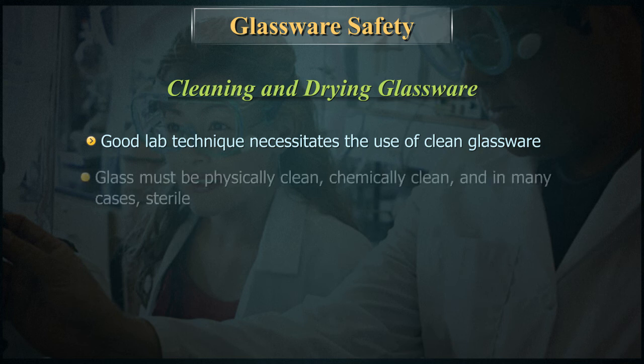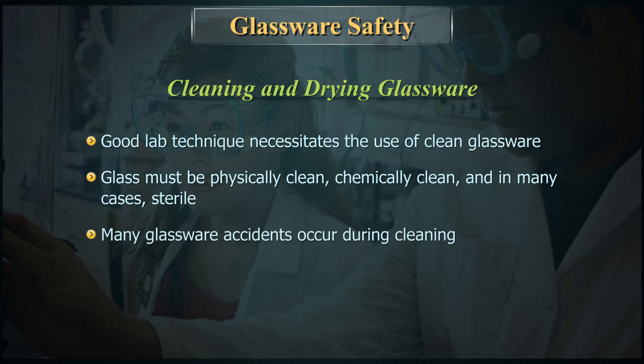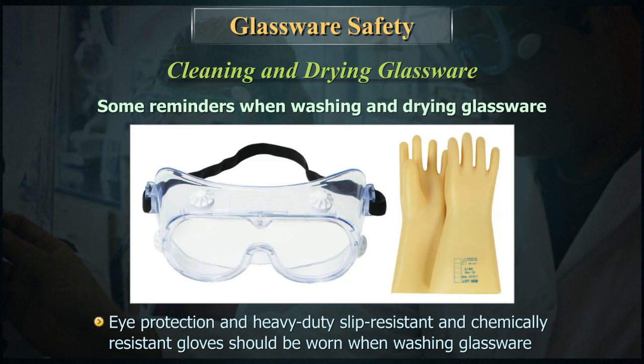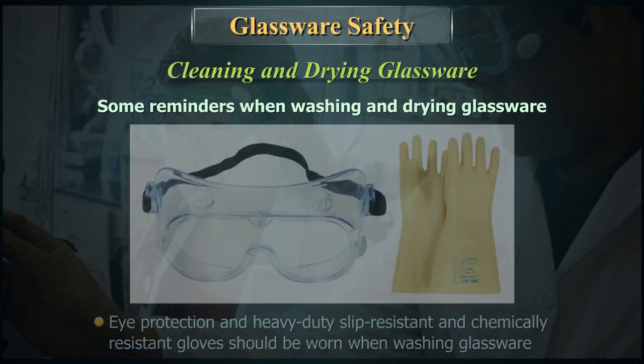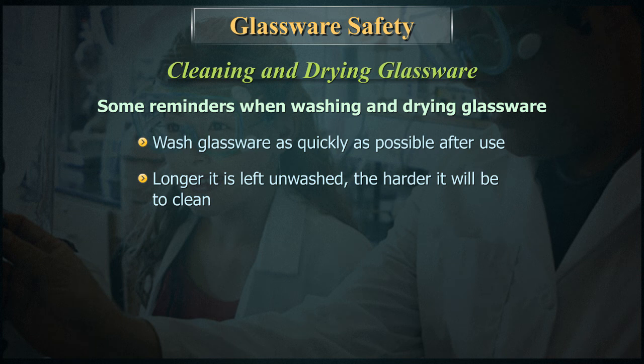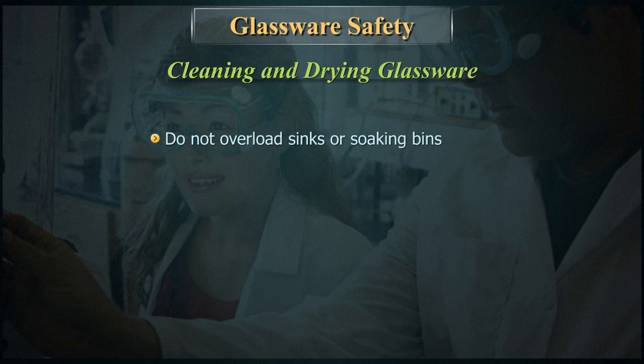Good lab technique necessitates the use of clean glassware. Glass must be physically clean, chemically clean, and in many cases sterile. Many glassware accidents occur during cleaning. Eye protection and heavy-duty slip-resistant and chemically-resistant gloves should be worn when washing glassware. Wash glassware as quickly as possible after use — the longer it is left unwashed, the harder it will be to clean. If necessary, allow harder-to-clean apparatus to soak in soapy water. Do not overload sinks or soaking bins.